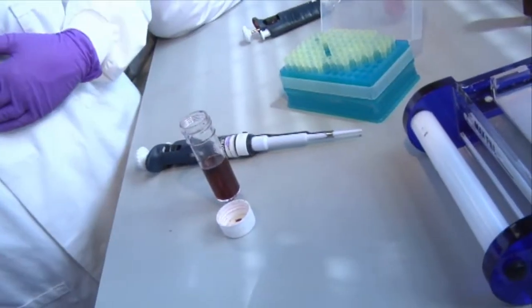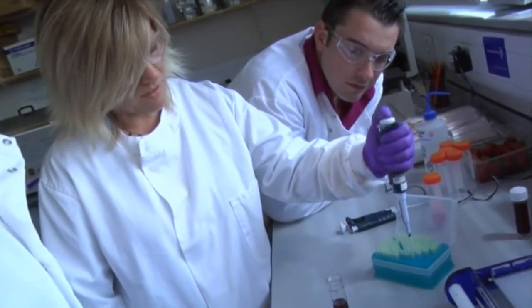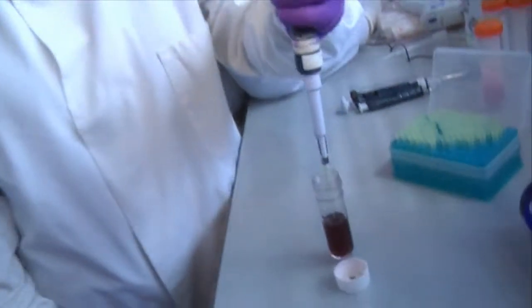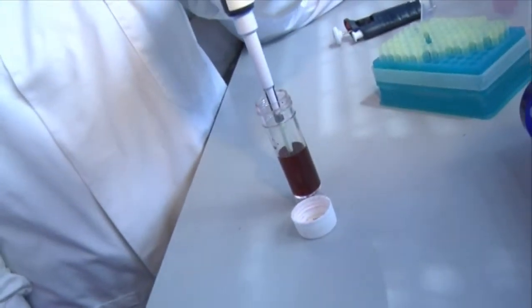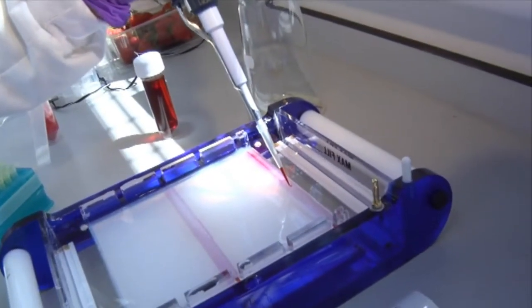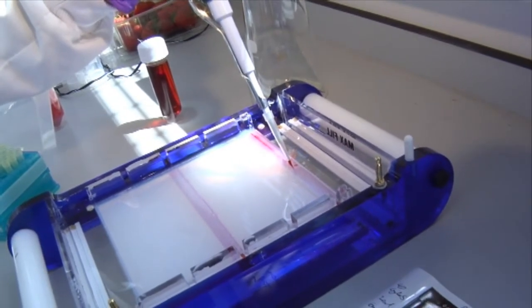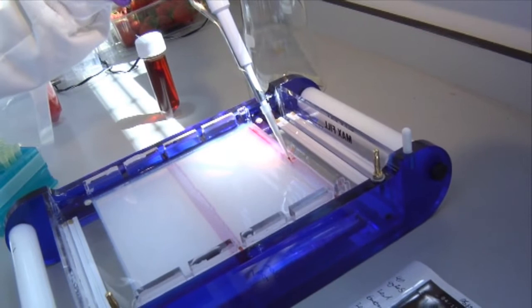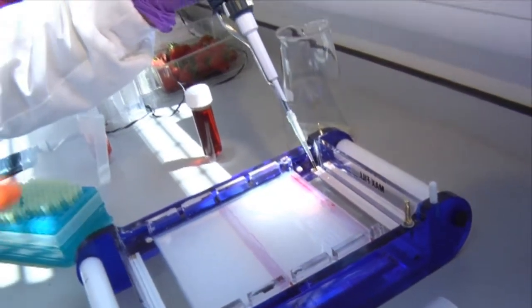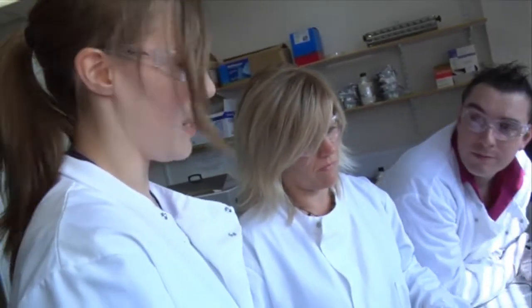Can I compare some DNA? Yes, if you take the pipette and you put a tip on it, and now press down on the plunger and get some liquid. This is how we measure out small quantities of liquid. And if you go over to the gel and put it in one of the wells. Whereabouts? Right there, yep, and head down and press down on the plunger. Perfect. And if you discard what's left into the pot using the other button, then we have all our samples next to each other, and we can compare differences side by side to see how active the DNA is and to see whether there's been a mutation.